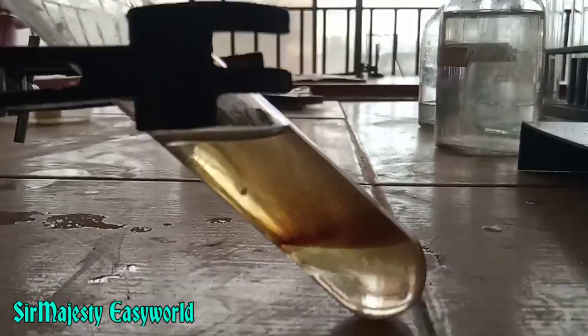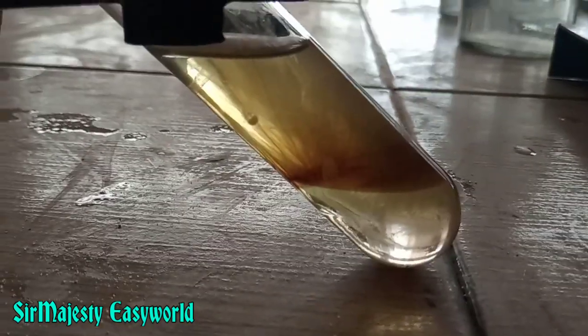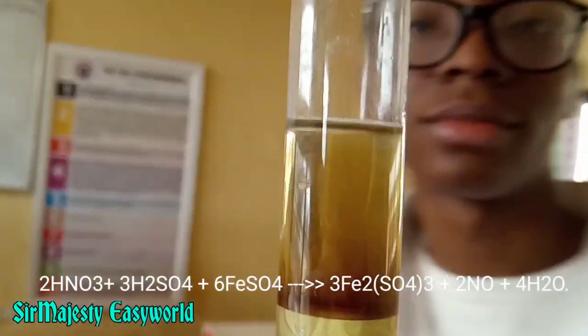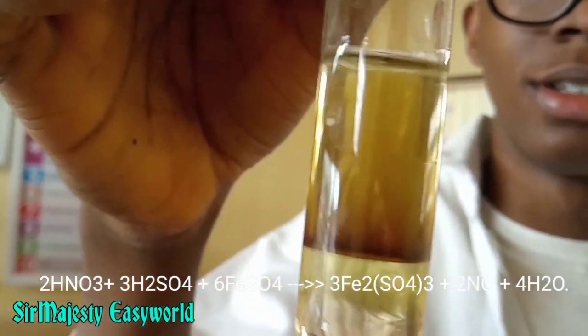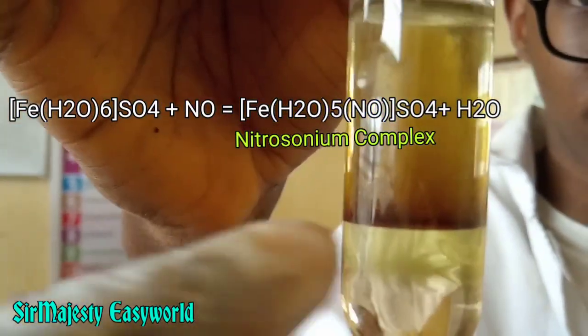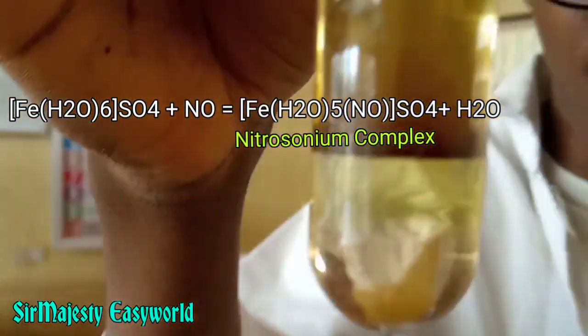That's the brown ring at the junction. This is a kind of redox reaction where iron(II) is the reducing agent and nitrate is the oxidizing agent. Iron(II) reduces nitrate and is itself oxidized to iron(III), with the formation of a nitrosyl iron complex which forms the brown ring.